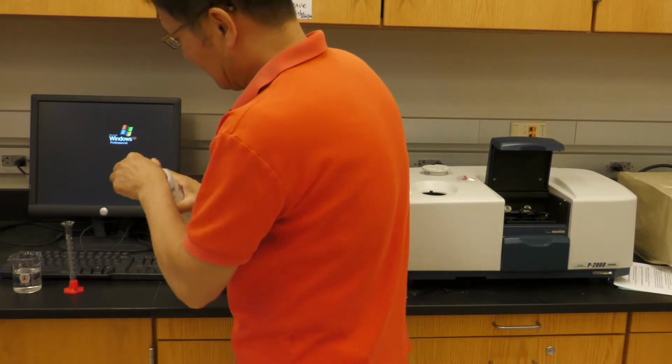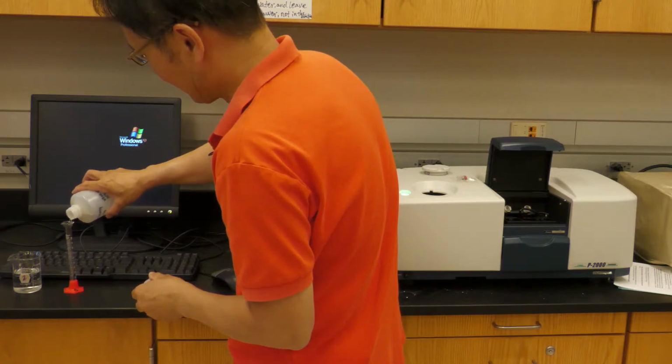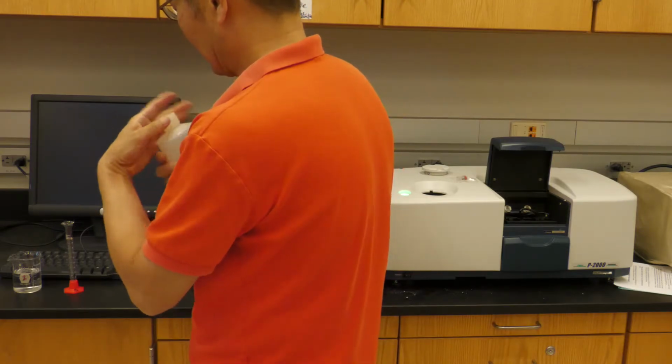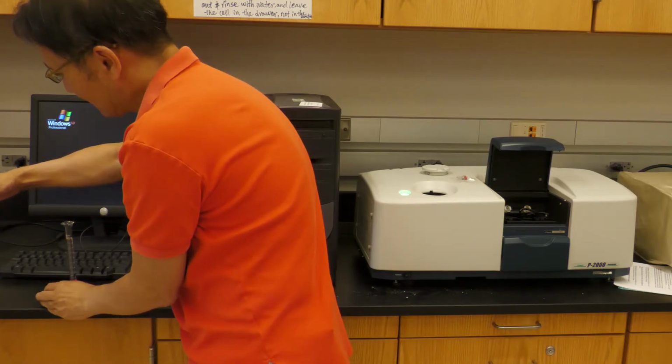So measure this one inside of this graduated cylinder.